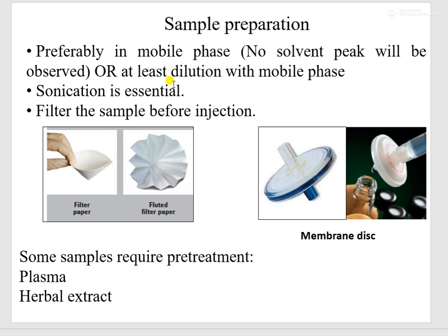Sonication of the sample is very essential for complete dissolution of your sample in the solvent. Of course, you have to filter the sample before injection, because any undissolved solid may clog the injector or may clog the system.